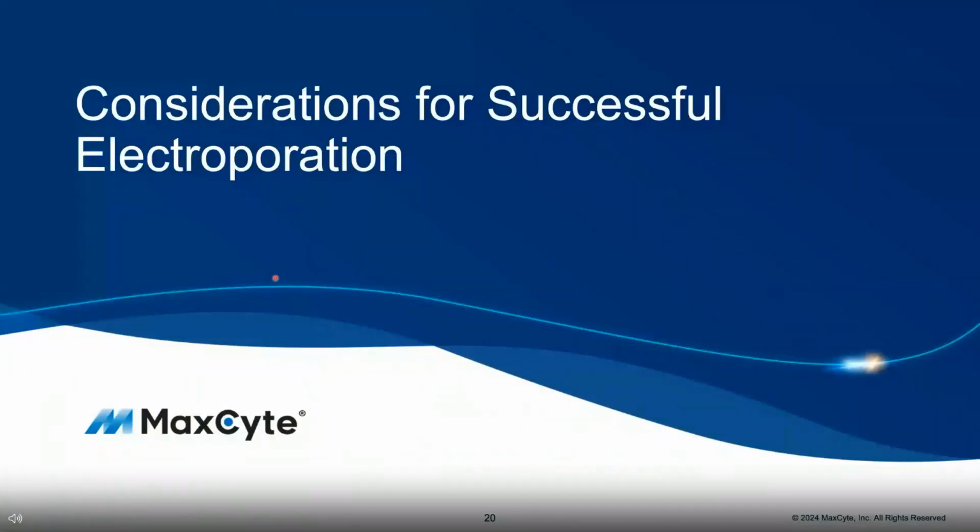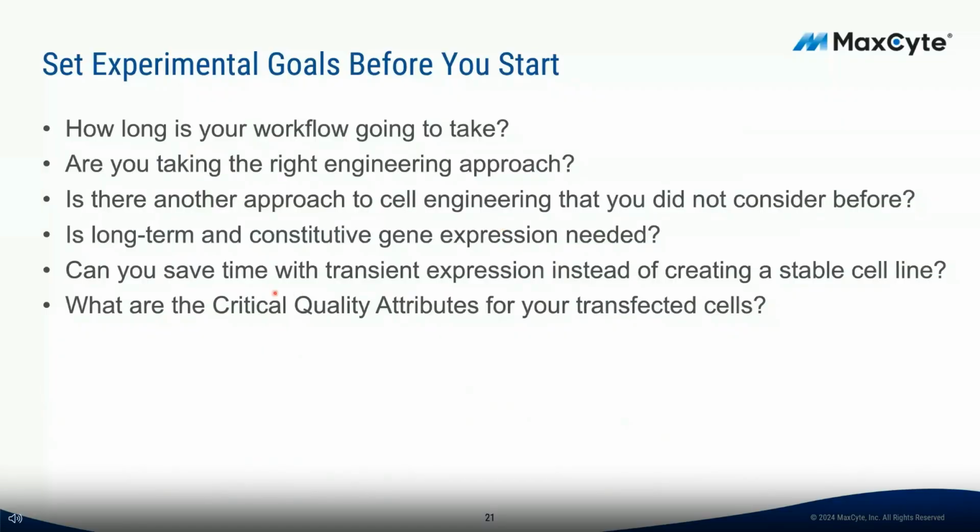And then I'd like to go over next considerations for successful electroporation. Okay, so next I'd like to go over how to set goals before you start. You need to consider how long your workflow is going to take, not just the transfection portion, but all the way to achieving those final results.